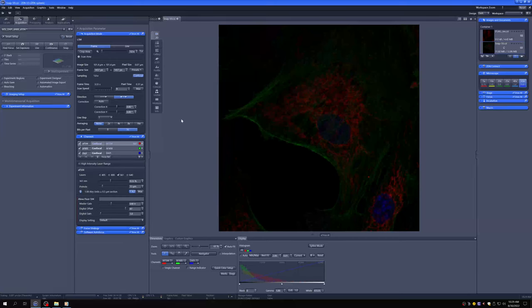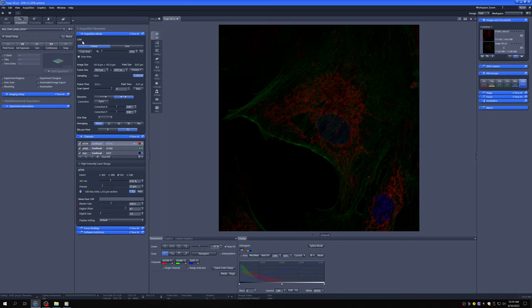To take a Z-stack, we have to have all of these settings set up so that we're happy with them and we like the image that we get.